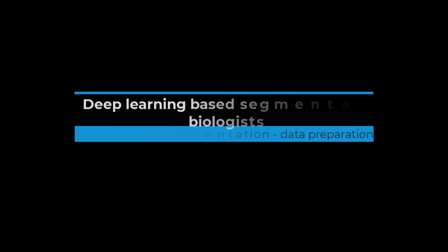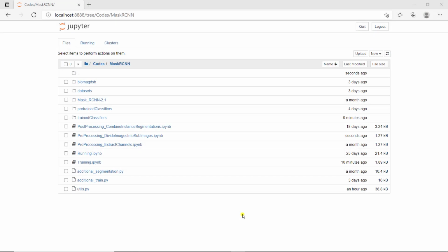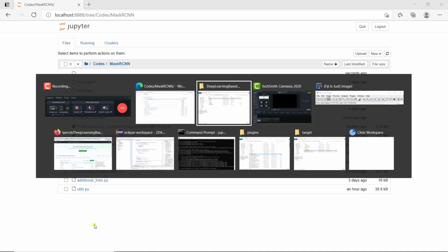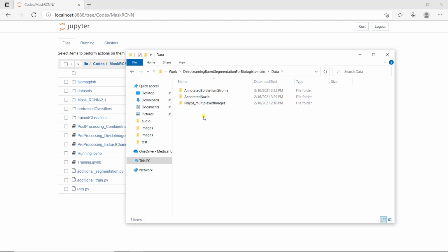In this video, I'm going to show you how to prepare the data to train Mask-RCNN for nuclei segmentation. So I'm in the codes directory for Mask-RCNN. Just before that, let's have a look at the data. If we go back to a folder, we have data, and the data we used for UNet was in annotated nuclei. So we're going to use the same data.